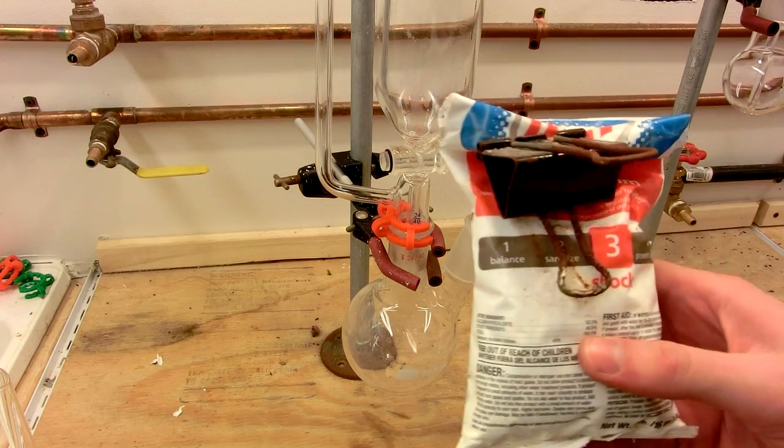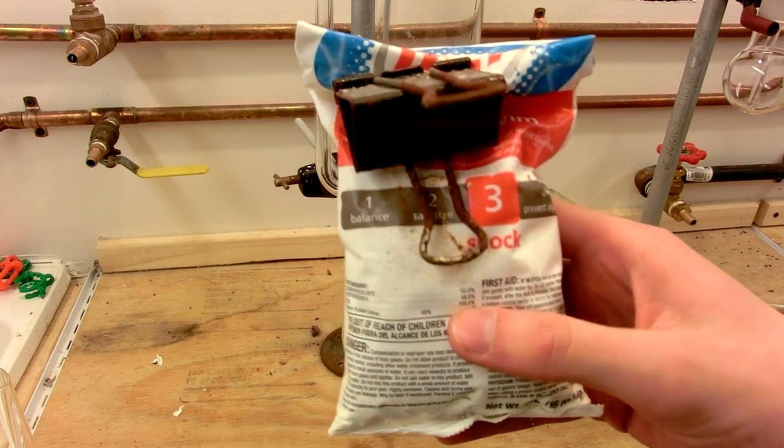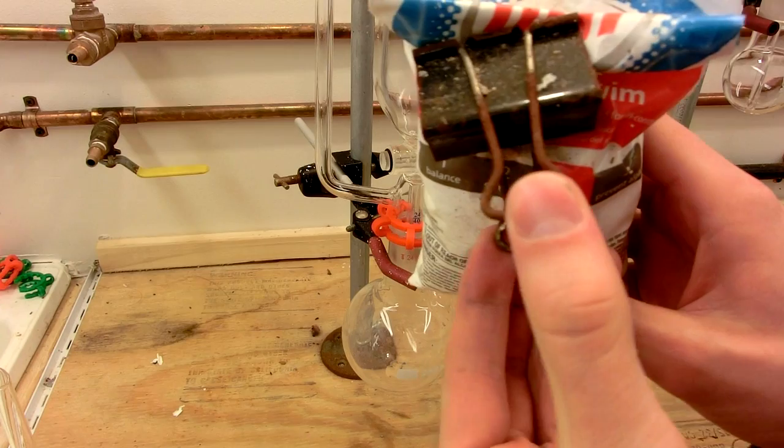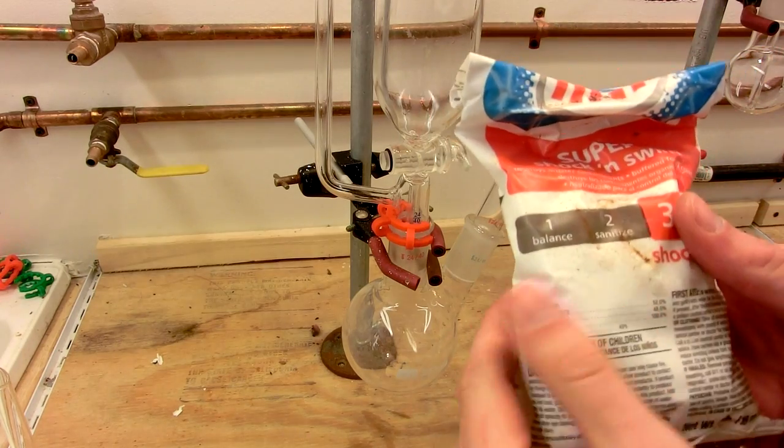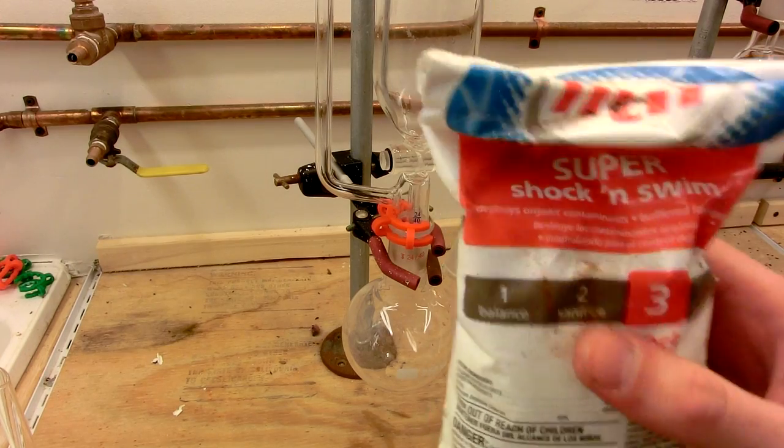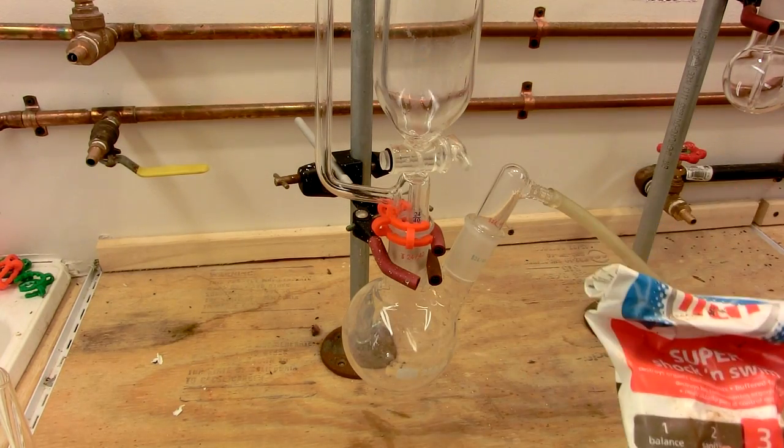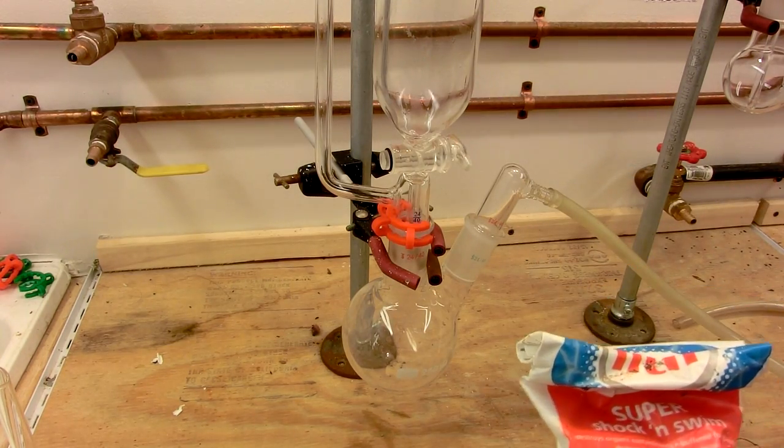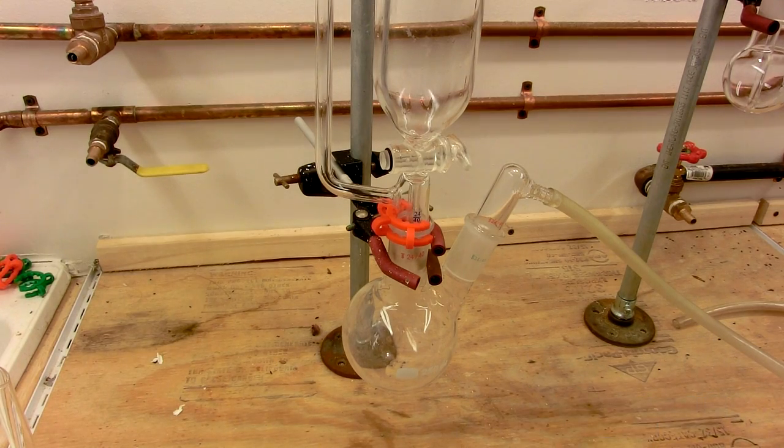So here I have HTH brand pool shock, and you can see chlorine is nasty, it corrodes the crap out of everything. This is 52% calcium hypochlorite, and we're going to use this. I usually measure out stoichiometric amounts, however, this is just a demonstration, so I'm going to eyeball it.